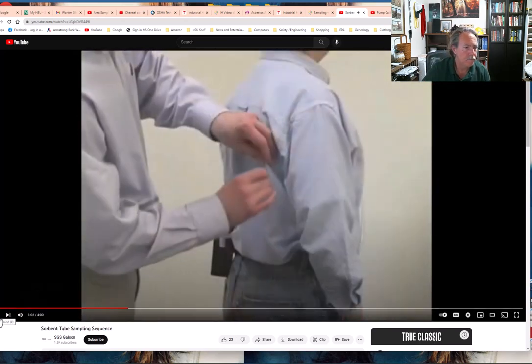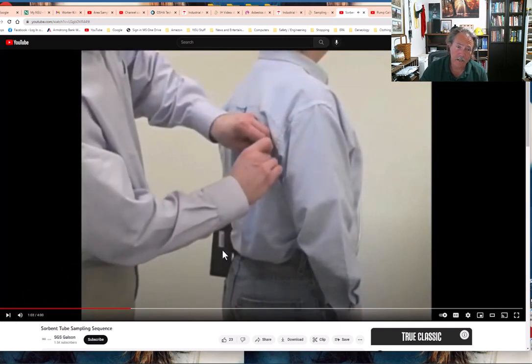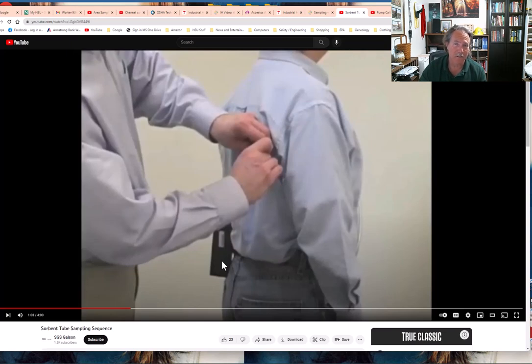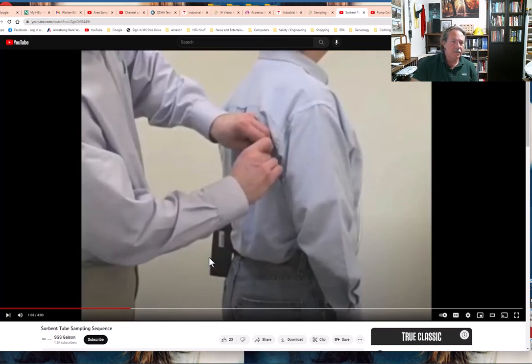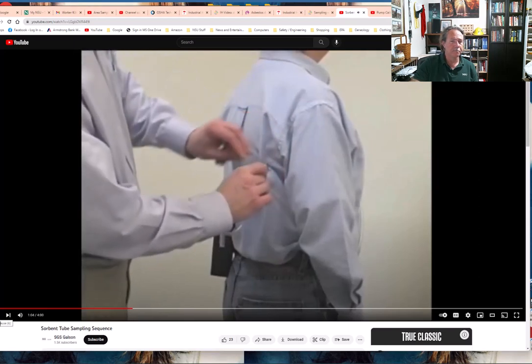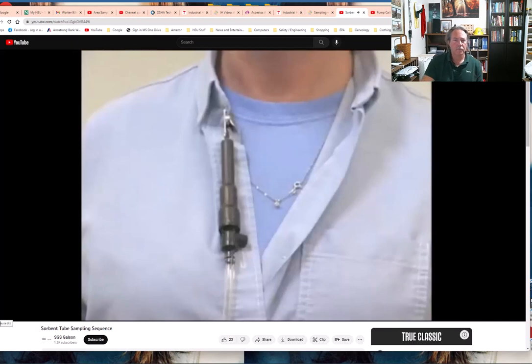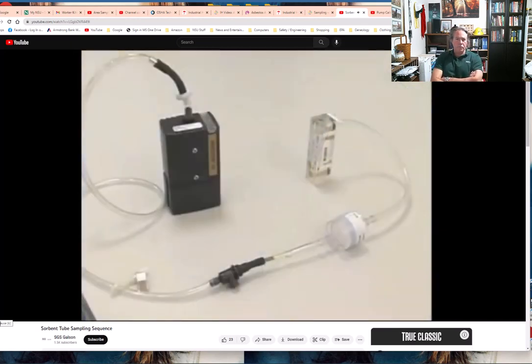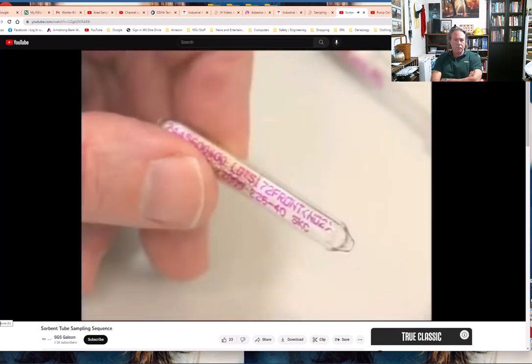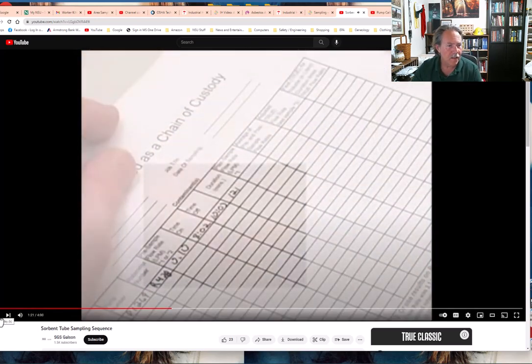Position the excess tubing so that it does not interfere with the work. It's a pretty simple process — you're using a personal sampling pump, some tubing, and the sorbent tube. Probably the most difficult thing is making sure you don't put the tube in backwards. Calibration can also be trickier with these devices. Be sure to use the tube covers whenever possible to protect the employee from the open ends of the glass tubes.